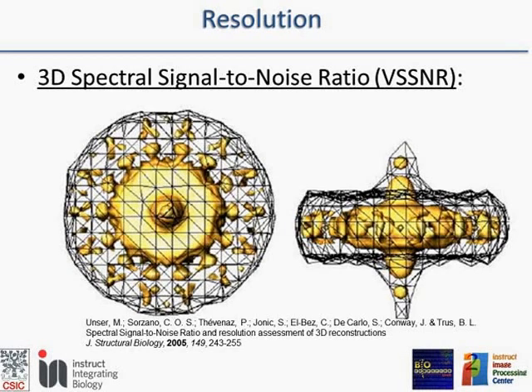So let's say the mesh is the threshold for signal-to-noise ratio 1. So that would mean there are certain directions in Fourier space where you have a lot of information. The signal-to-noise ratio is rather high, while there are some other directions in which you don't have so much signal-to-noise ratio.